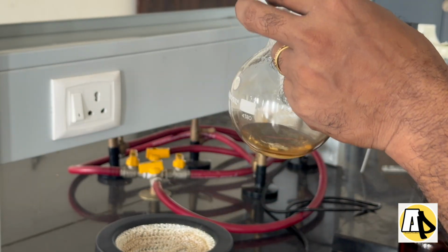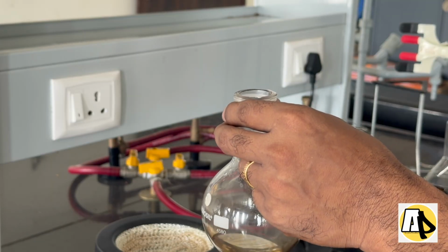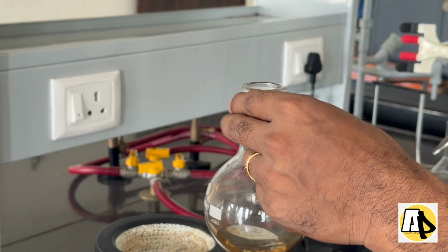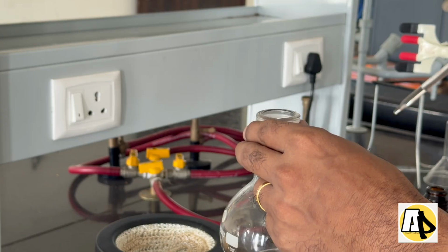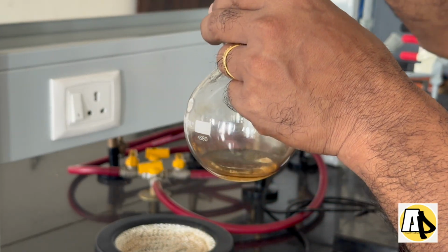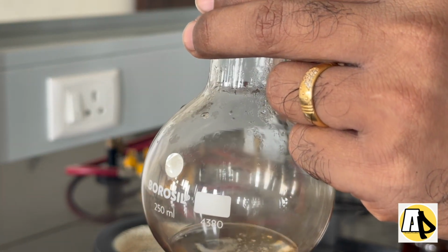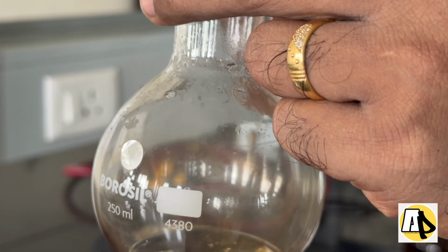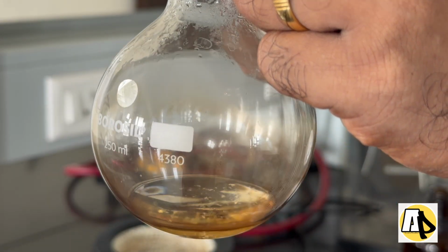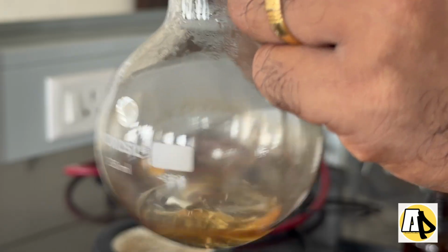Now the solution in the RBF, that is sodium salicylate, is cool. Now we are going to add HCl into this. So you can observe when I add HCl dropwise into this, you will notice some formation of solid. See, there is some reaction, there is formation of solid into that. So dropwise we will add with continuous shaking.